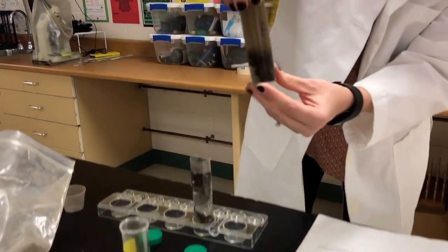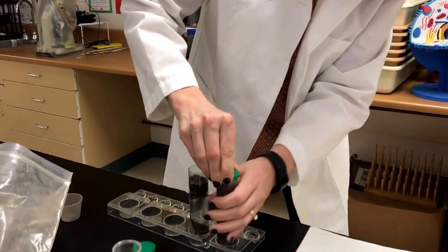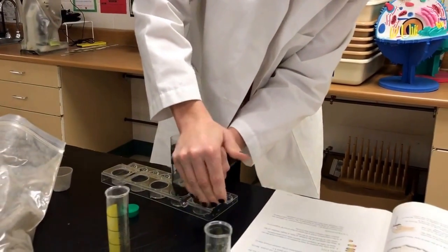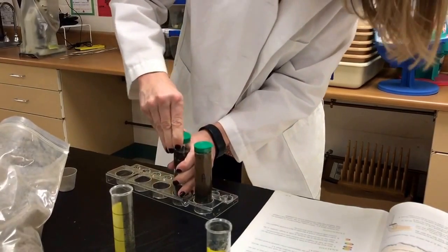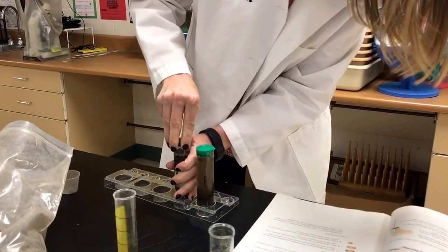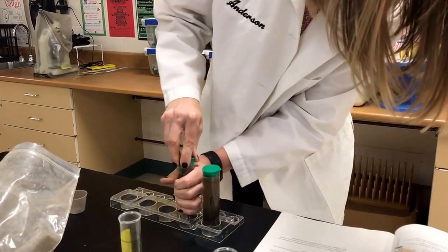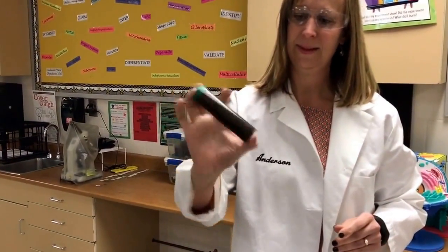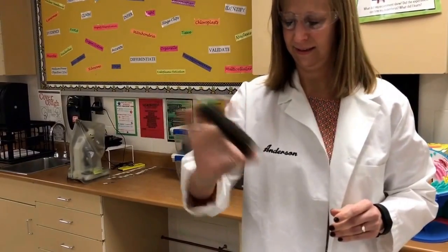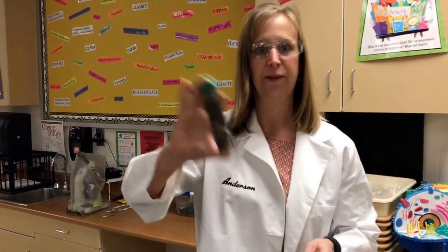We've labeled the containers so you'll know which one is which. Then we're going to go ahead and cap them. Easier said than done. Perfect. Then we're going to shake each one for about 10 seconds, and then we're going to let them sit. Your job is going to be to observe the final results.